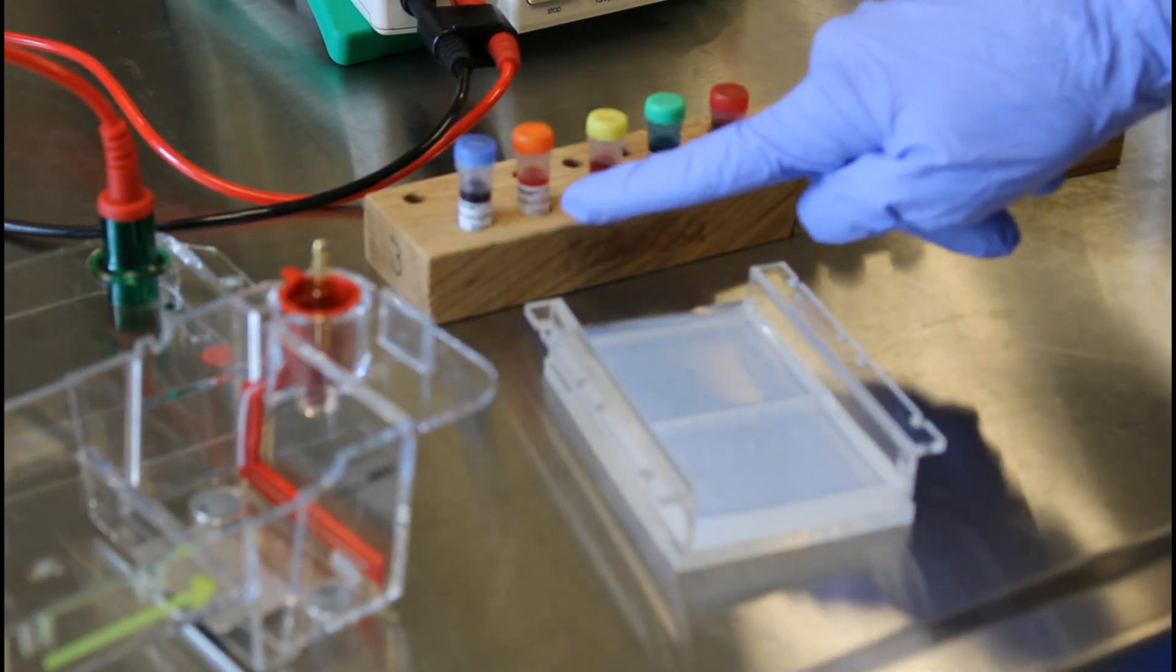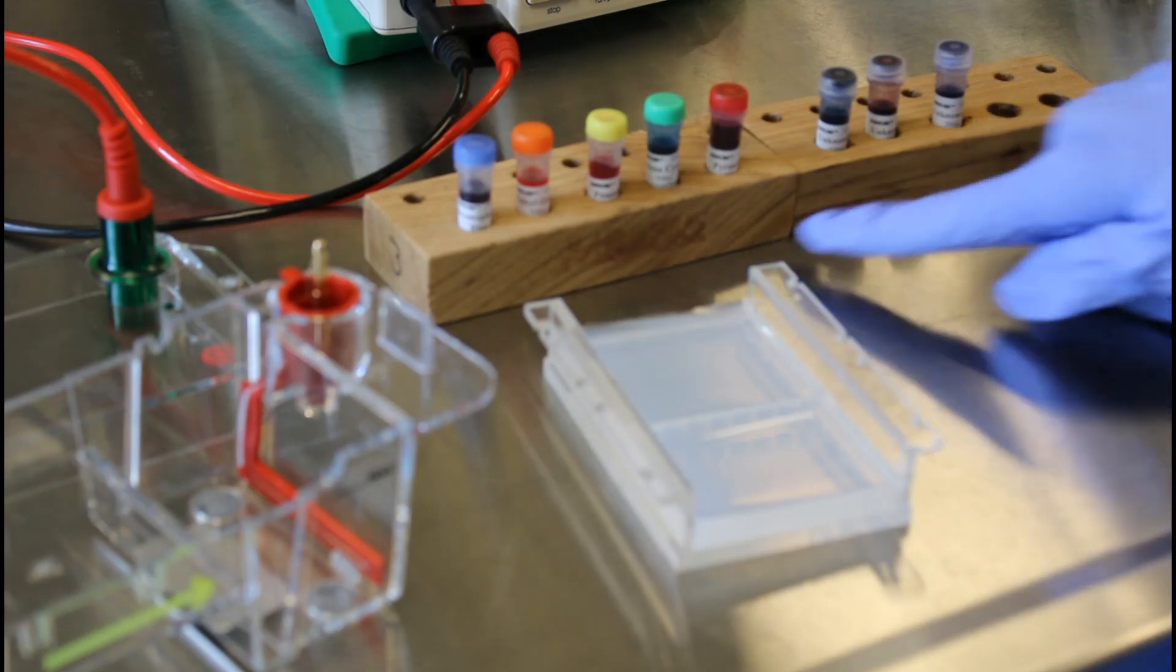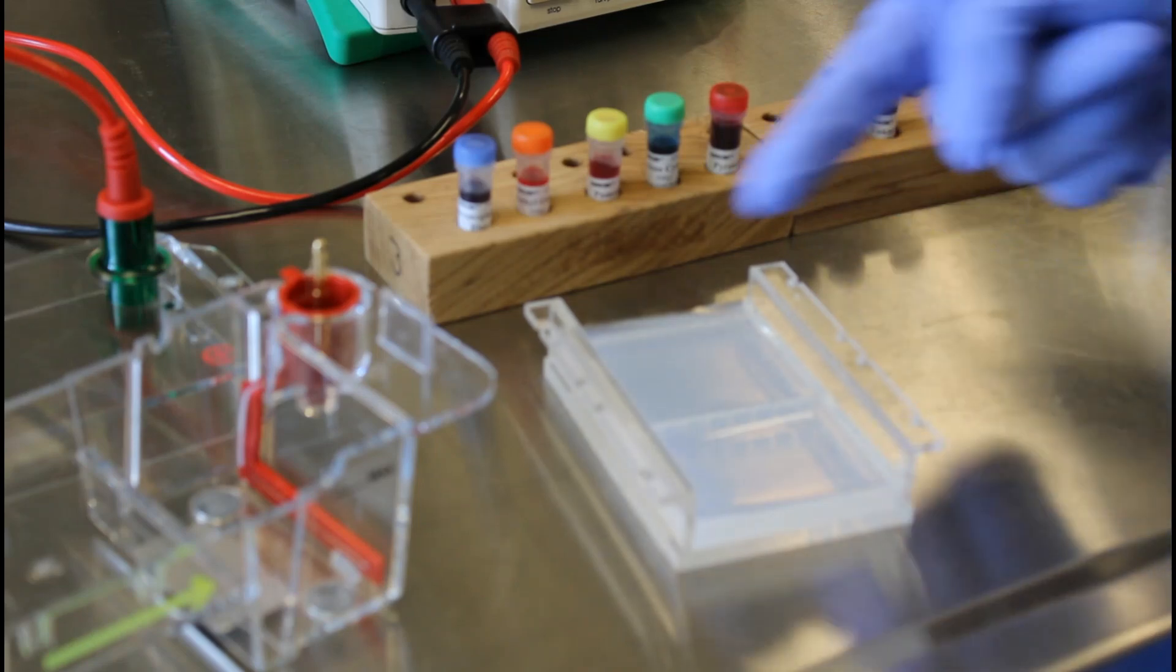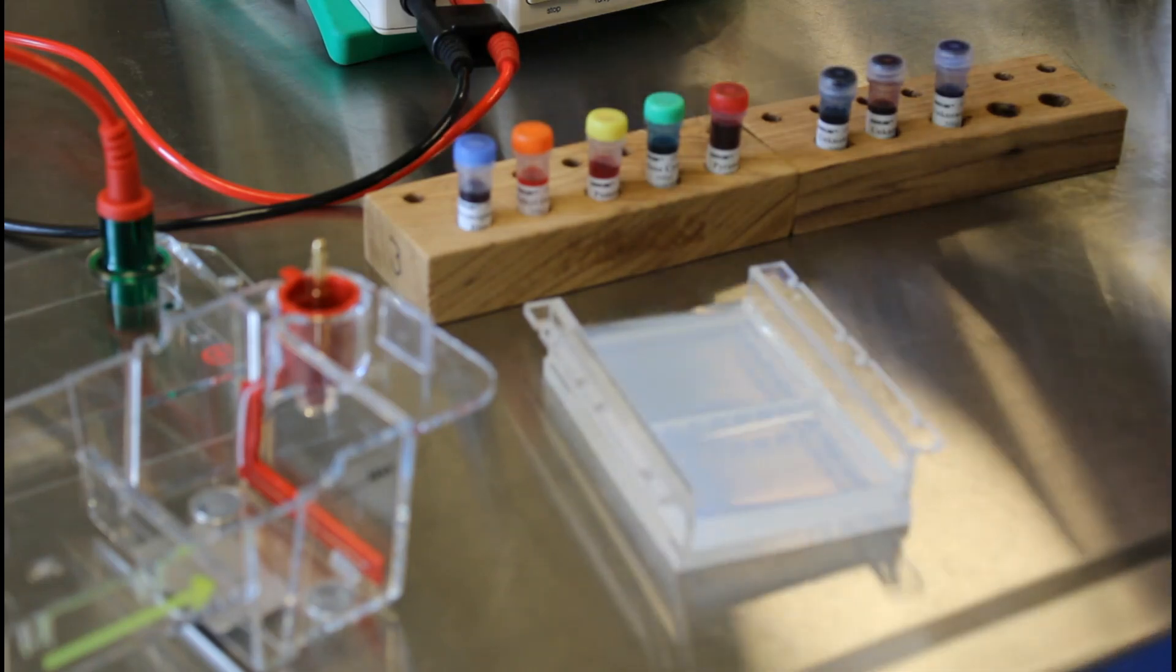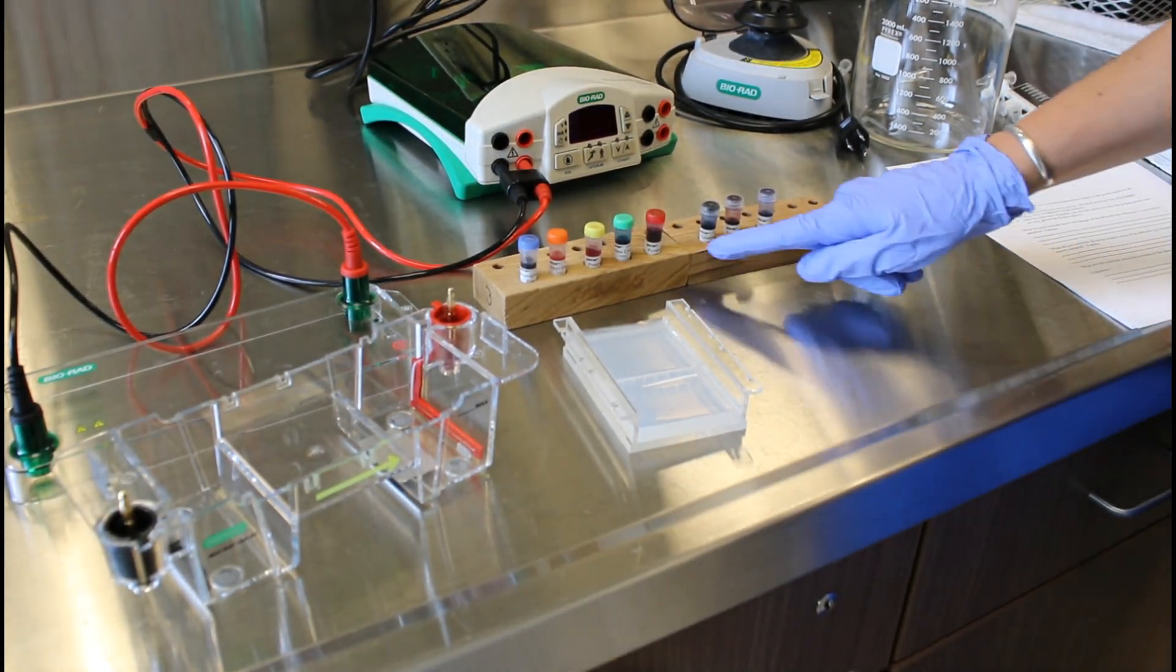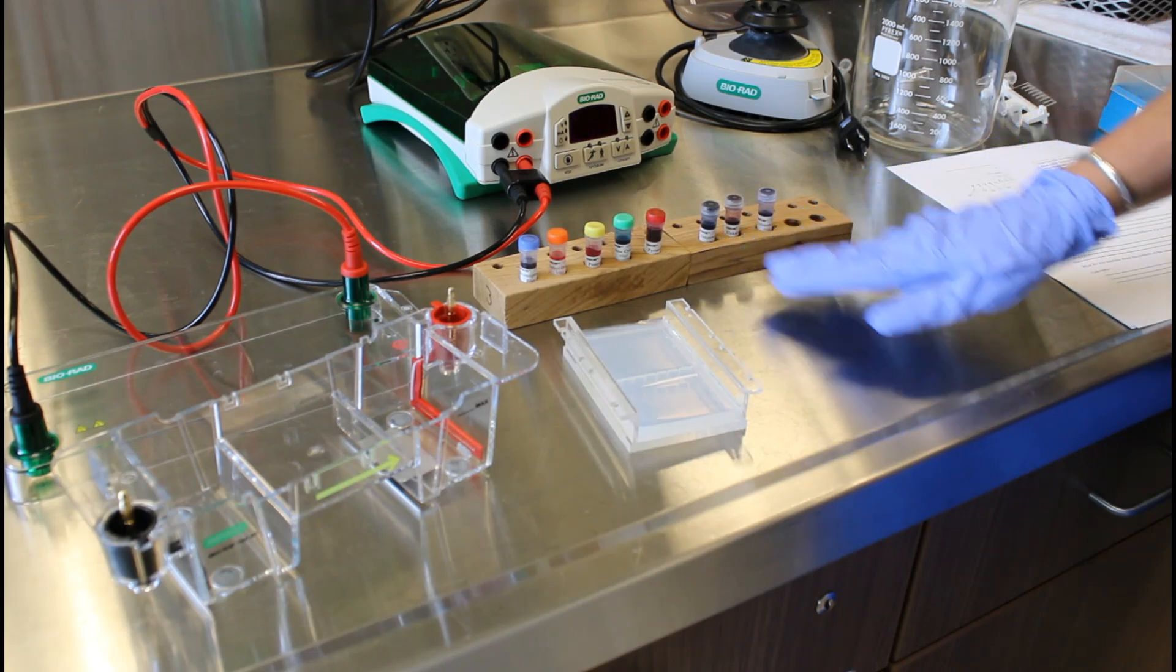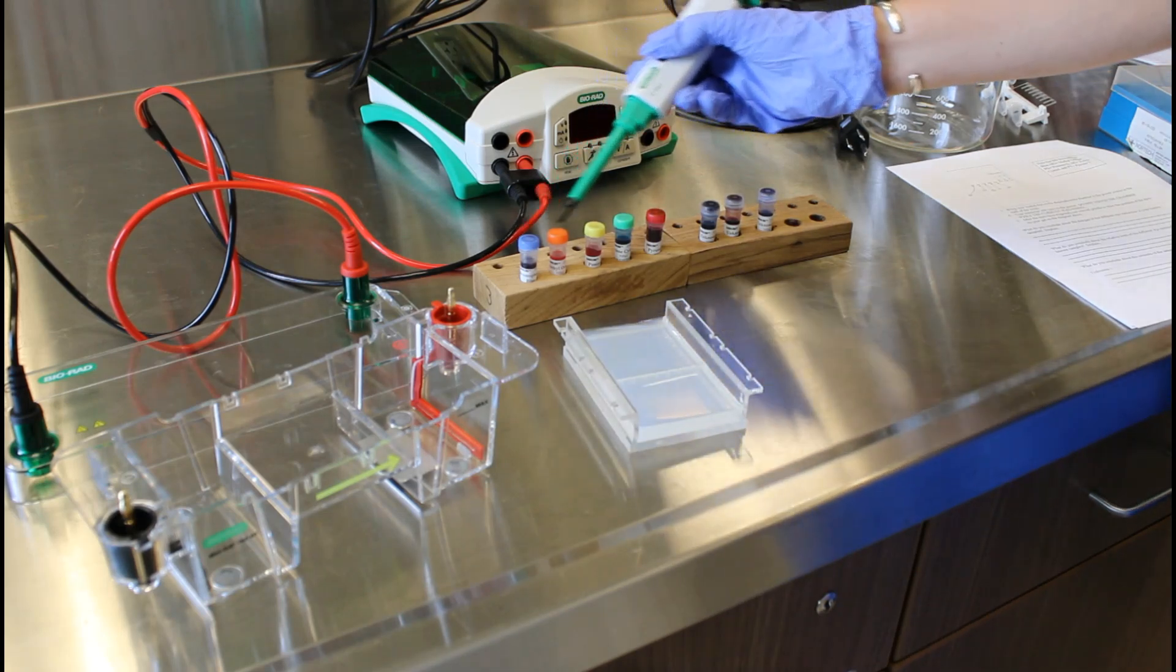There's one, two, three, four, five dyes of known identity and then one, two, three dyes of unknown identity. We're going to load each of them up into a separate well and then we're going to run the gel with electricity. That electricity is going to pull the molecules through the gel and we're going to try to determine the identity of the molecules in these unknown dyes by comparing them to the pattern that we see for the known dyes.